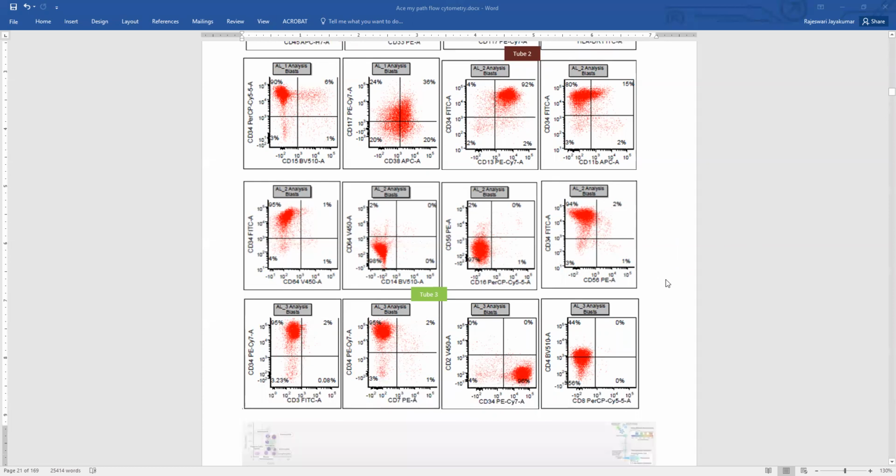And one other use of CD56 is that sometimes, in the bone marrow or in the peripheral blood, we don't see a large number of blasts. Especially in bone marrows, if we see a smaller number of blasts and they express CD56, we can distinctly say that, although the blast numbers are not increased, these are aberrant blasts. I mean, abnormal blasts with aberrant expression.